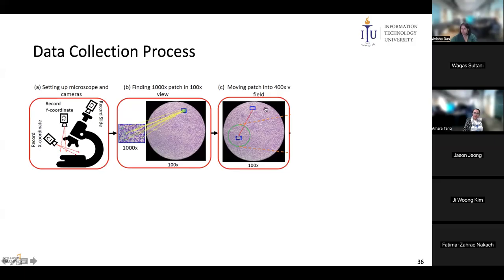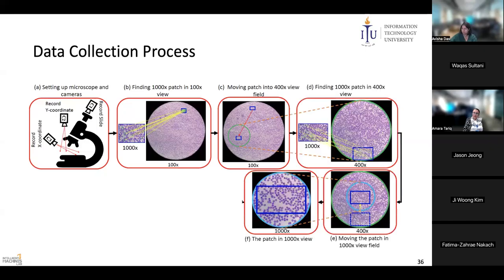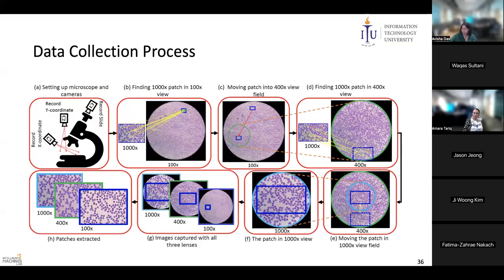So what we did is that we used, again, simple KLT based tracking, and it's a real-time tracking. So once we know this patch contains the field of interest, now we move the knobs of the microscope, we can keep track of these cells, and this way we can keep capturing the data.